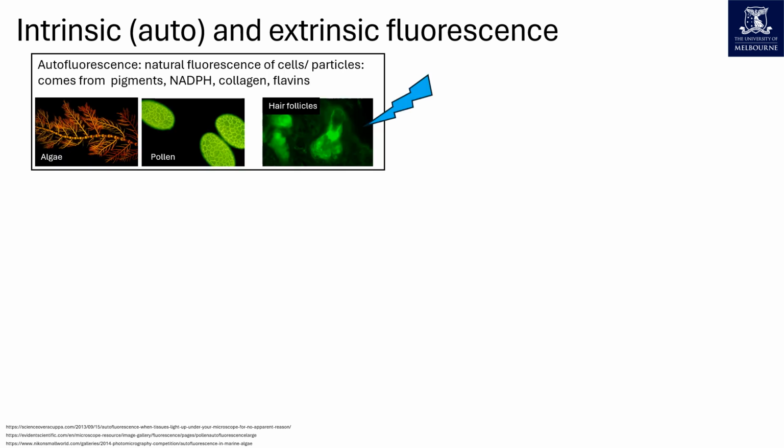PE is an example of a fluorescent molecule or pigment that occurs naturally in algae and cyanobacteria, allowing them to photosynthesize. Viewed under a microscope, excited by the right wavelength, these life forms will autofluoresce because of the presence of PE and other pigments and structural and metabolic components.